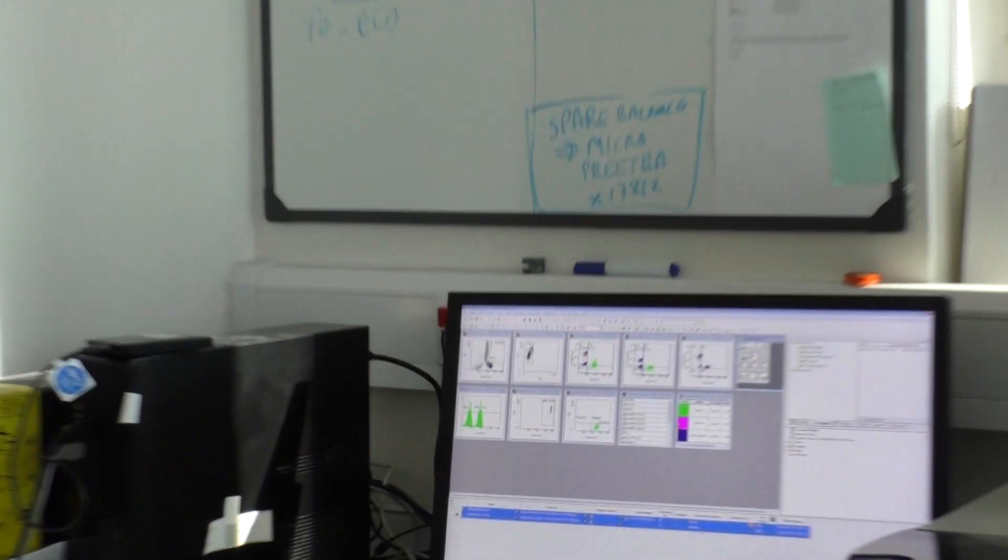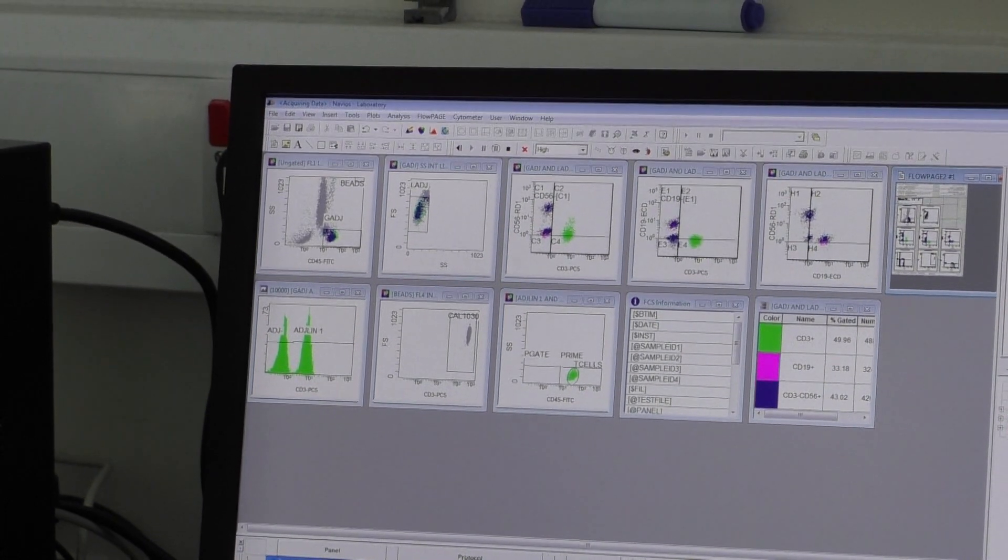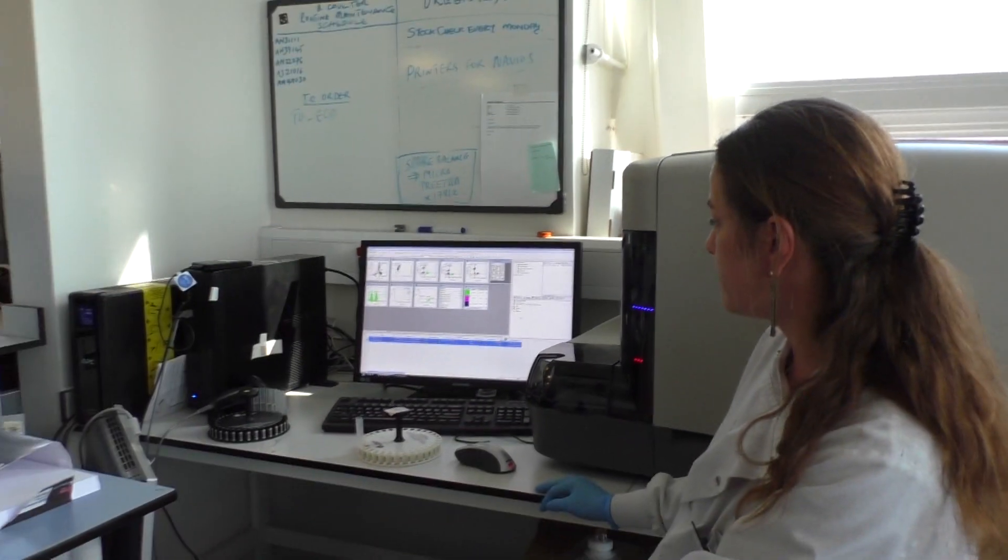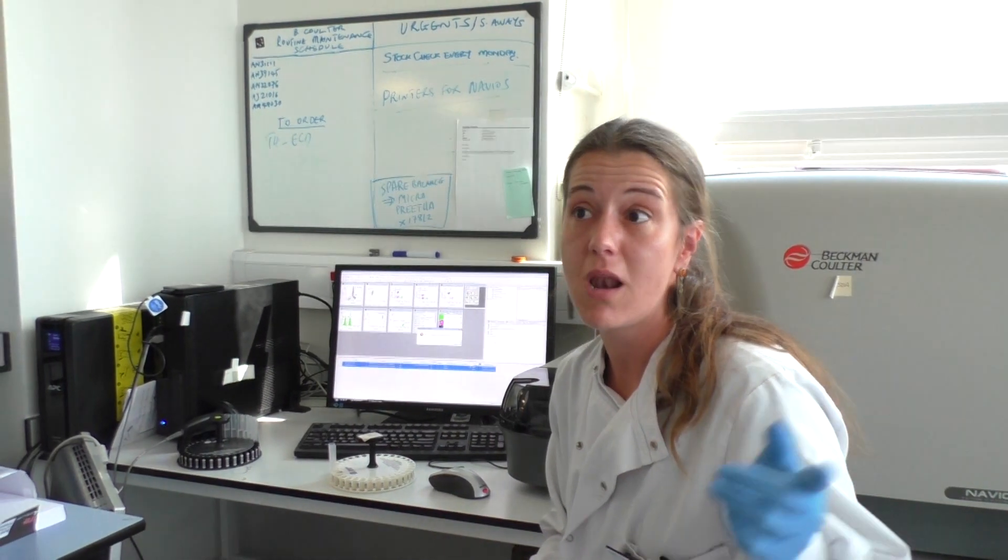You can see there are beams going around - this is how the cells are counted. From here we have a system that actually transports the results directly from here to our LIMS system.